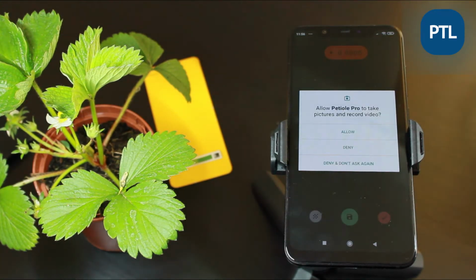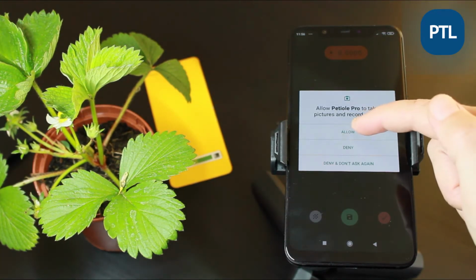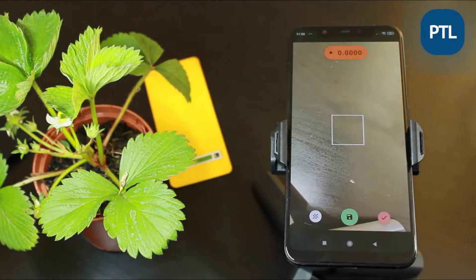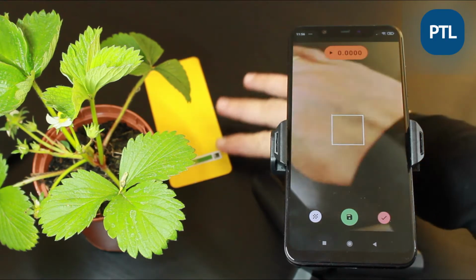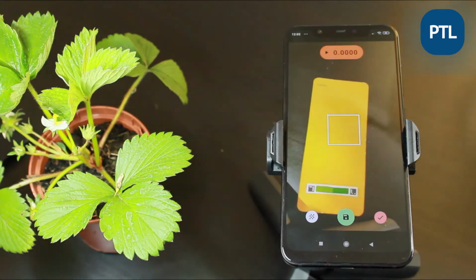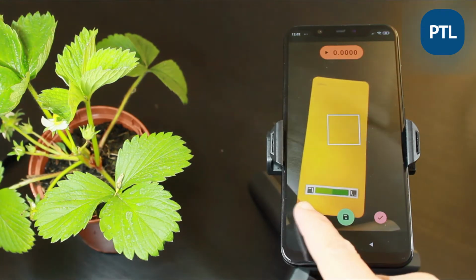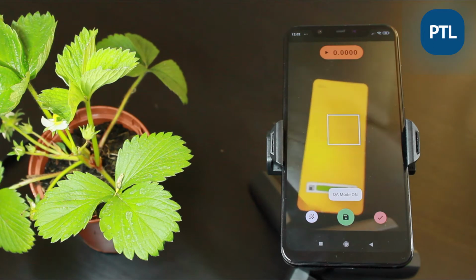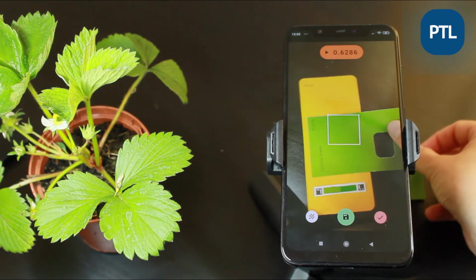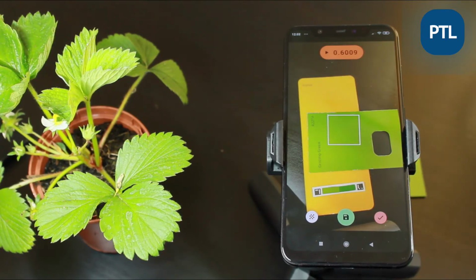After you are ready to continue, you need to press the button Measure and allow Petiole Pro to use the camera and file storage for correct work. After the permission is given, we can start the measurement. First of all, we need to place the Colour Calibration Pad in front of the camera. What is important? It has to stay within the sight of the camera all the time. To activate its work, we need to press the QA button on the left-hand side of the screen. This is a button which has a checkerboard picture on it.